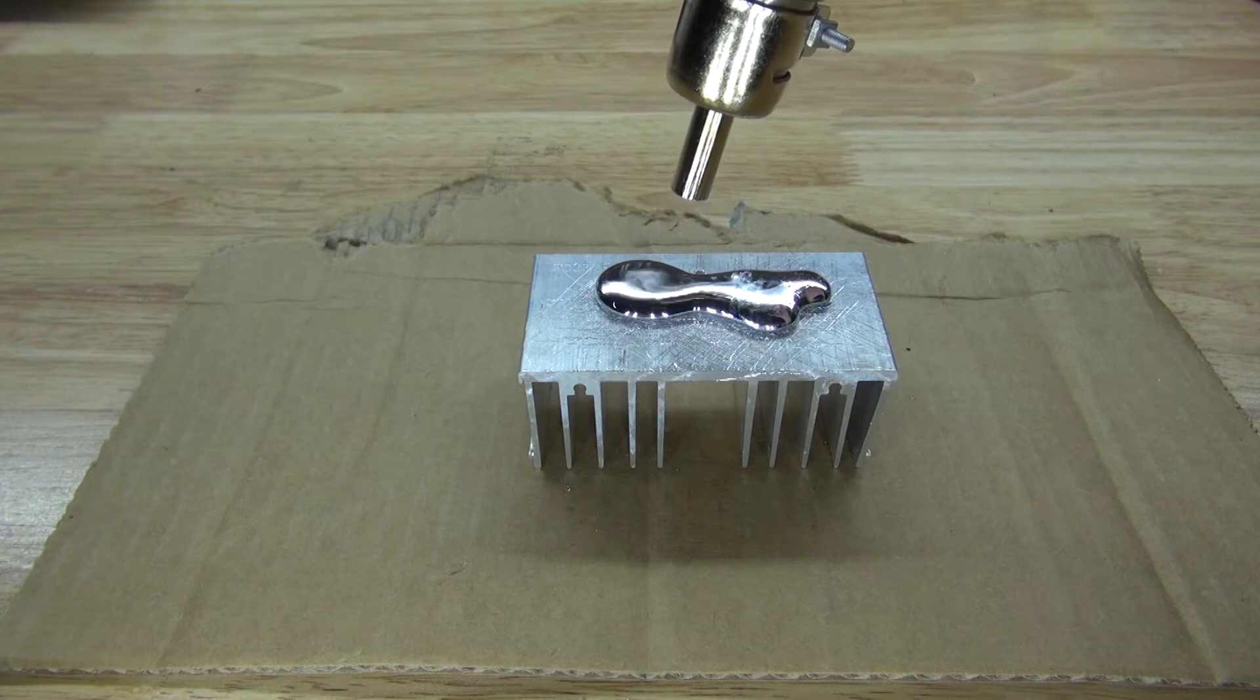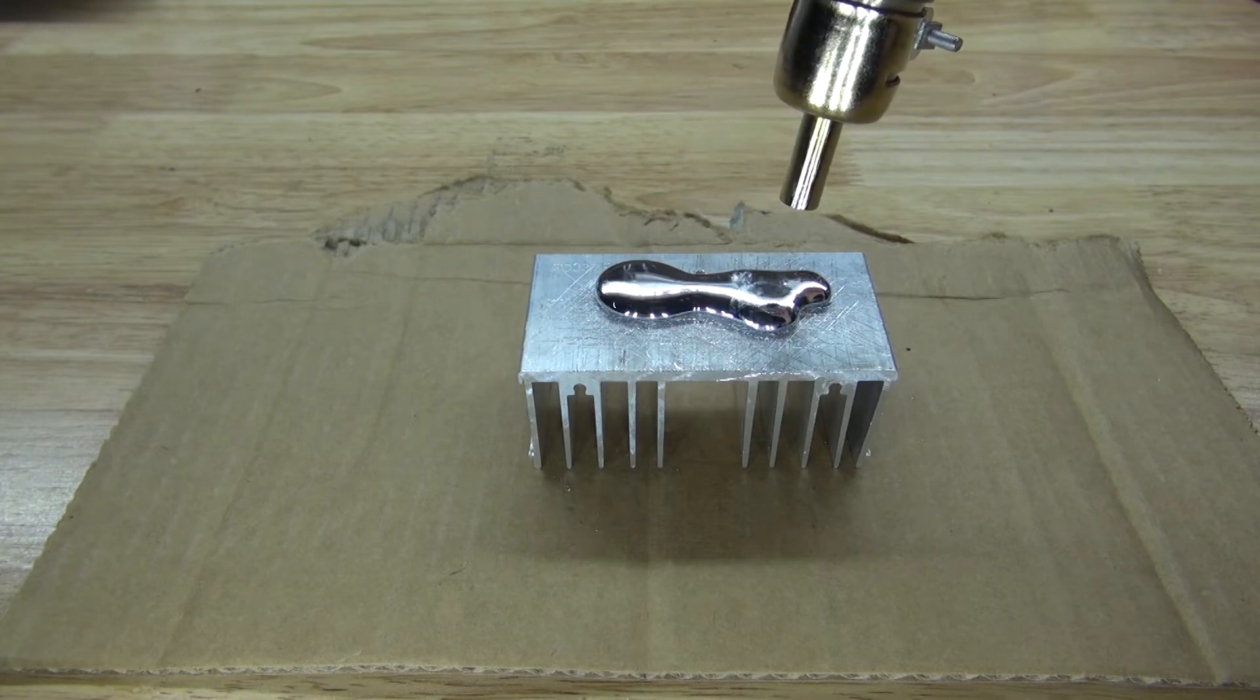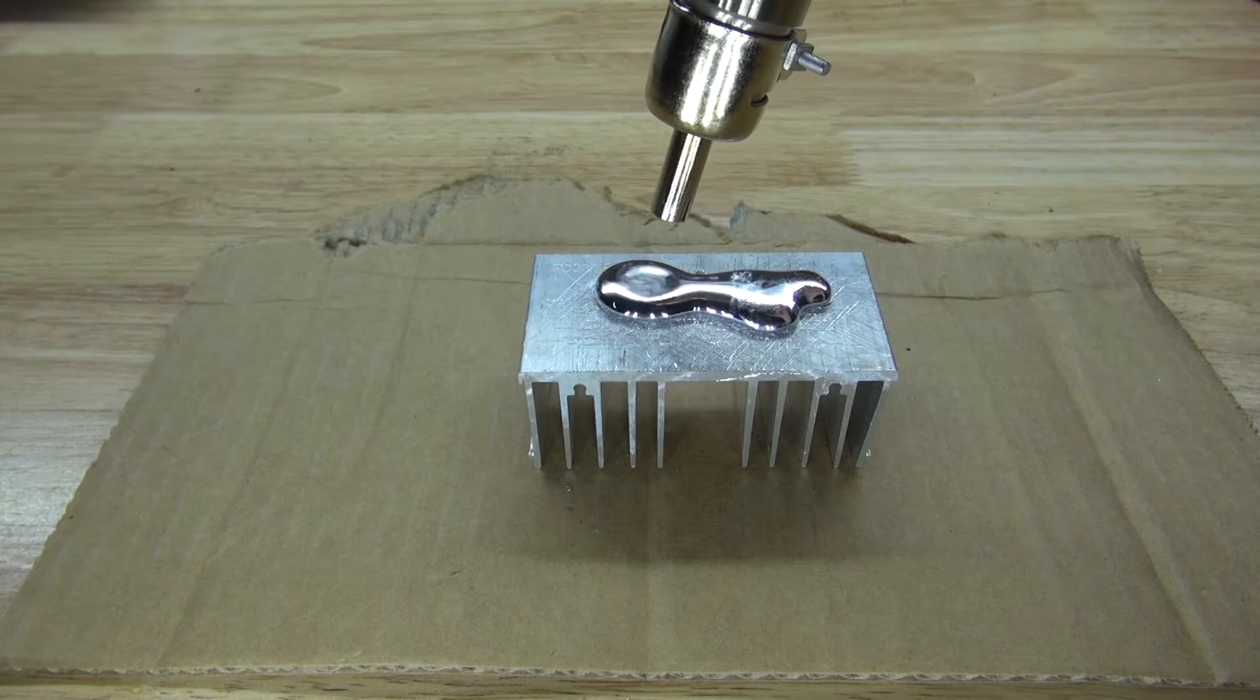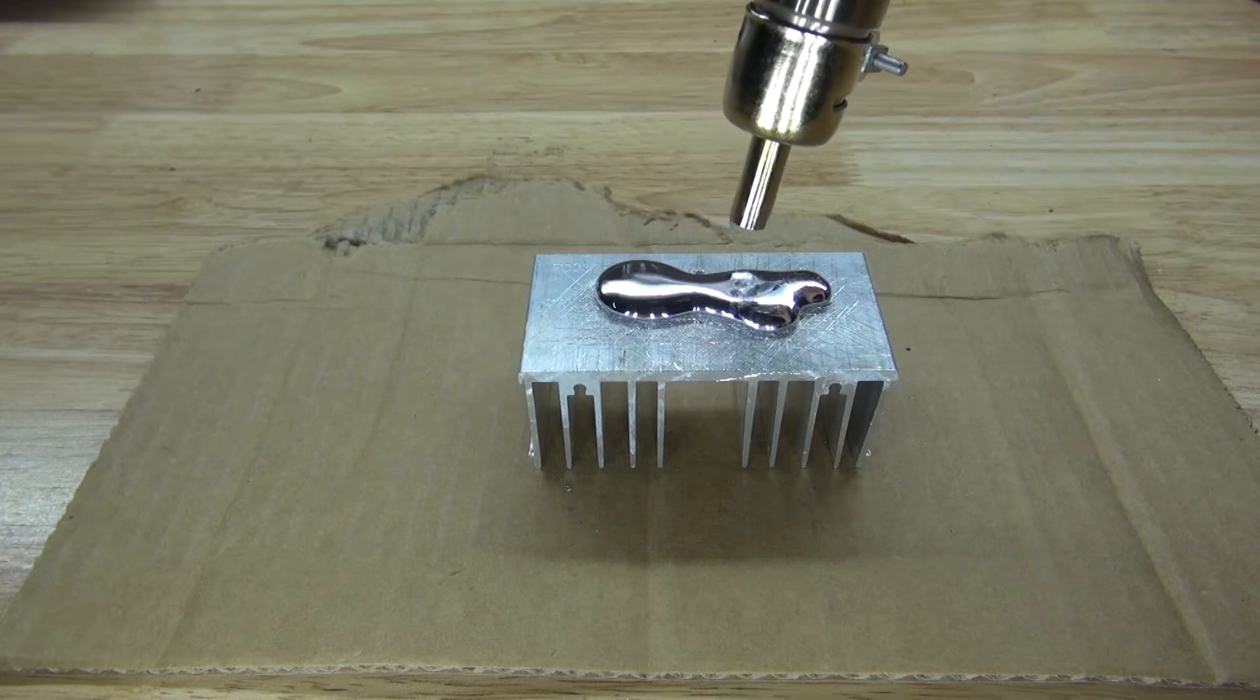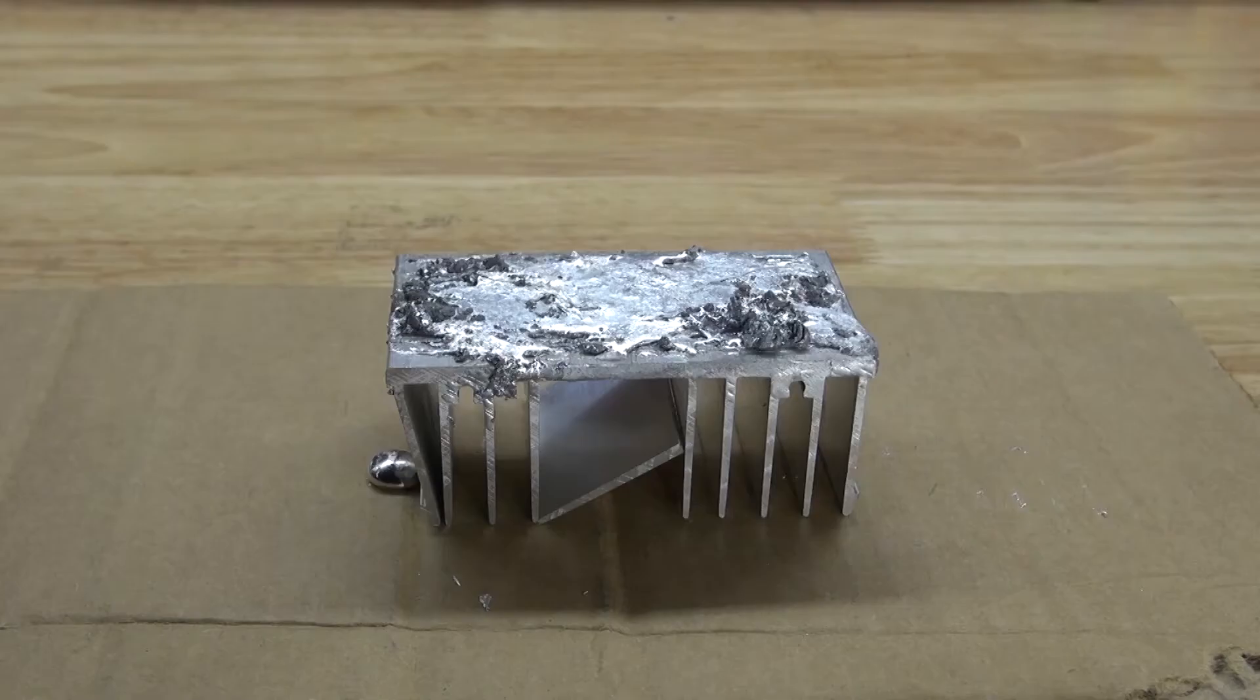The reason why I'm using this hot air gun is so that way I can speed up the process, so it can react a little bit faster. And my room is cold, so the gallium keeps solidifying too quickly. And there you have it.